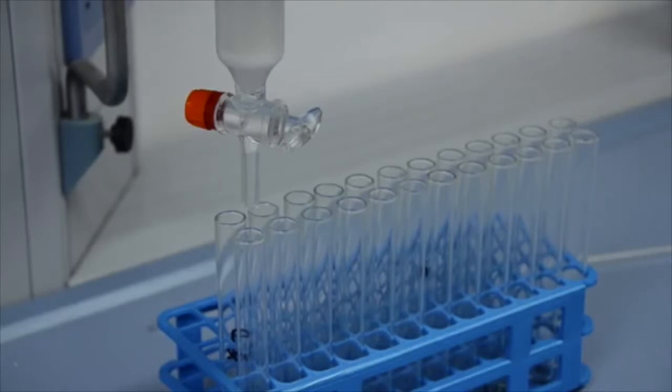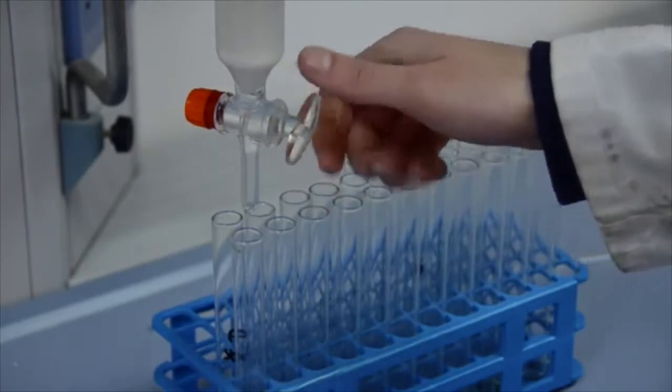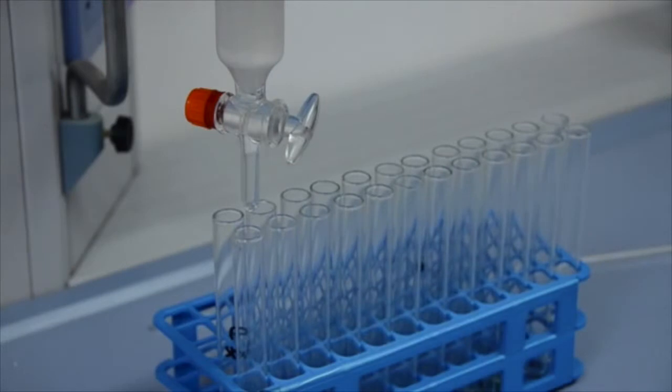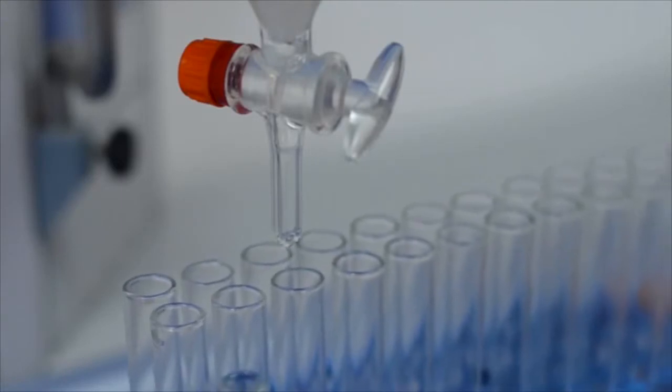Prepare a test tube rack with a considerable amount of clean test tubes. Open the tap and adjust the flow rate to give a regular flow, which is not too fast and not too slow. Around 5 to 7 minutes for a test tube should be sufficient. Filling them to around 3/4 of their capacity is enough.